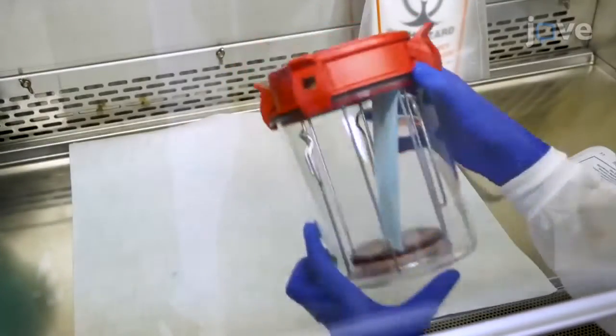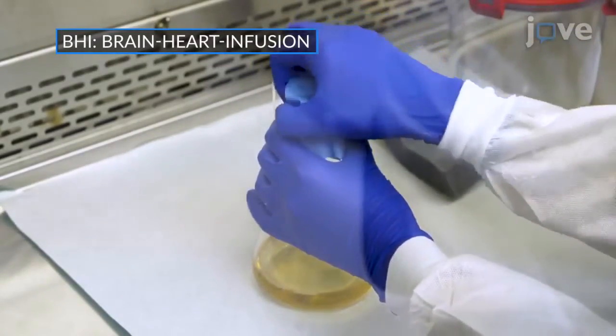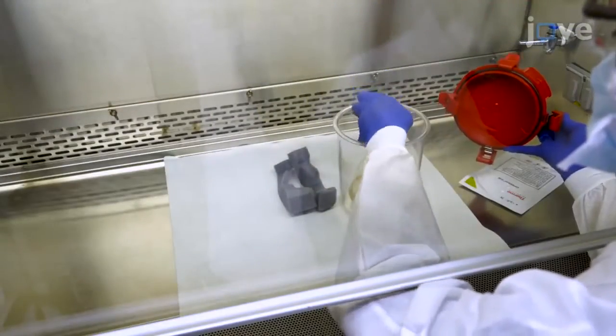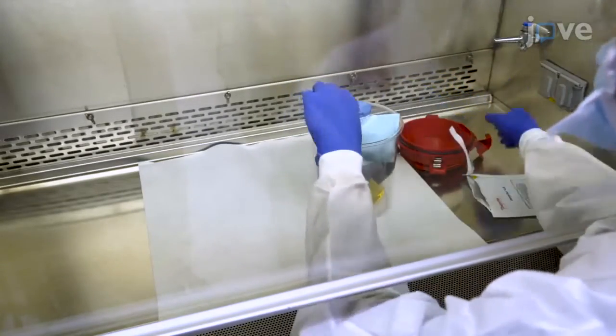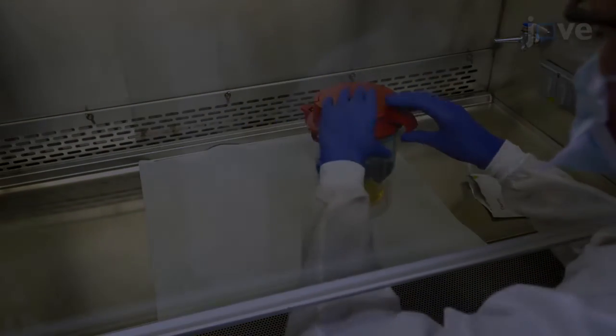24 hours later, loosely cover a flask of BHI broth, and place the flask into a new anaerobic jar with a sachet that will produce a microaerobic environment for an overnight incubation at 37 degrees Celsius.